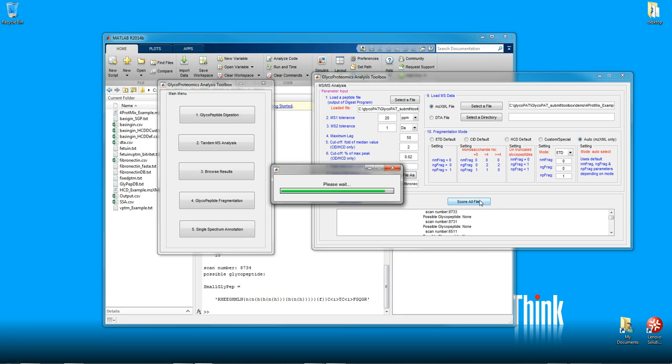Similar to the current GUI version that is run in the MATLAB environment, a standalone GUI version of the program is also available that can be run in an identical manner, yielding exactly the same results. While this standalone version is not shown here, its installation is straightforward. Simply download the program from www.virtualglycome.org and double-click the program to start it. This standalone version does not require the MATLAB software program, and it is platform independent. The MATLAB version is shown here since it allows a more complete explanation of the workings of GlycoPAT.